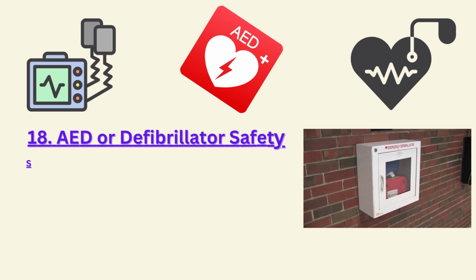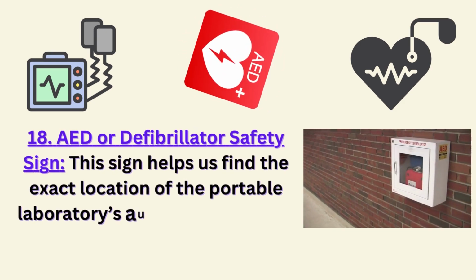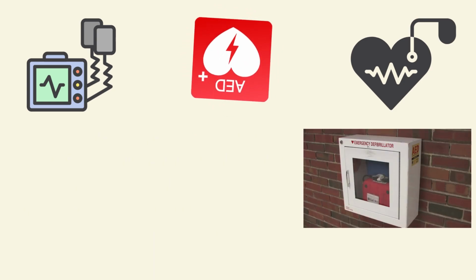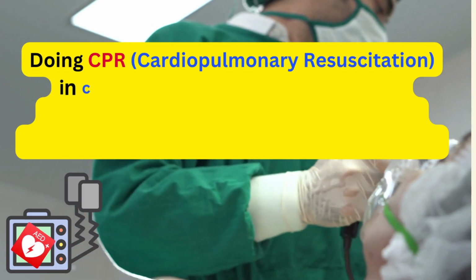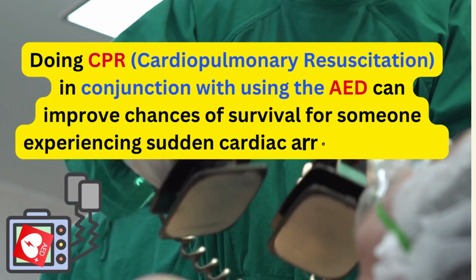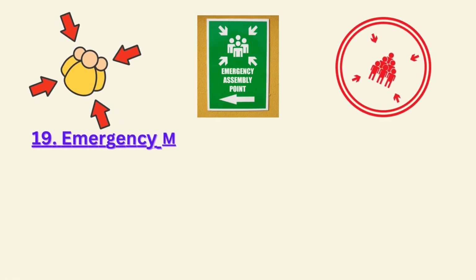18. AED or defibrillator safety sign. This sign helps us find the exact location of the laboratory's portable automated external defibrillator (AED). Doing CPR in conjunction with using the AED can improve chances of survival for someone experiencing sudden cardiac arrest in the lab.